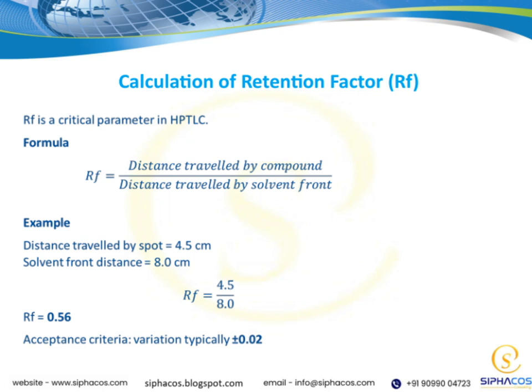Keep in mind, consistent measurement techniques are important to ensure accurate and reproducible RF values. Understanding how to determine the RF helps us interpret our chromatograms and make meaningful comparisons between different samples. This ties back to our overall goal of analyzing and identifying compounds efficiently and accurately.